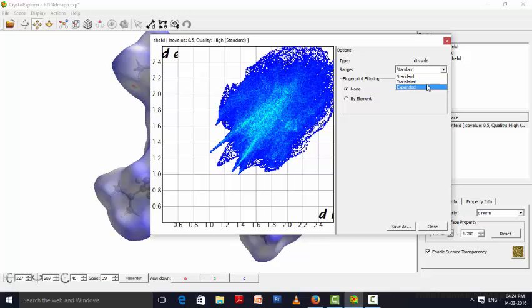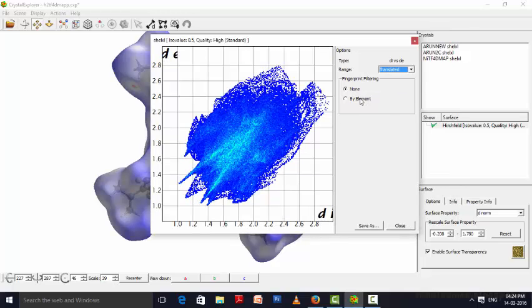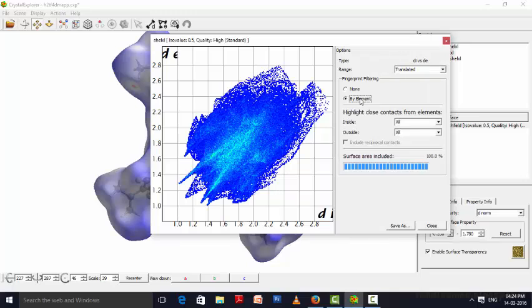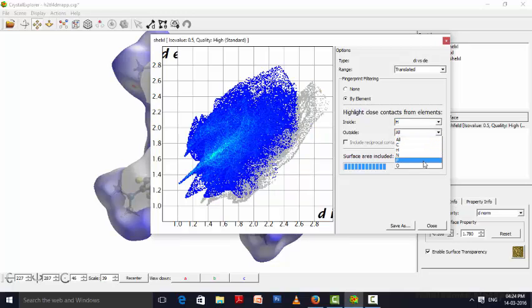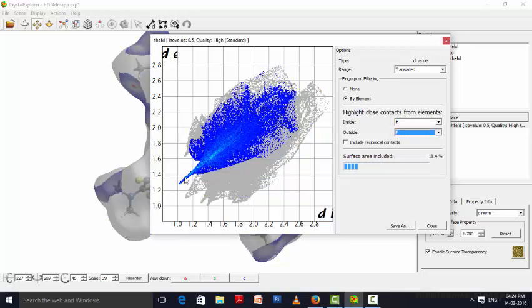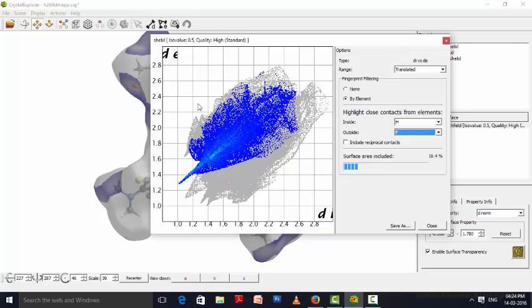I will be just making inter-translated view. And then by element, we will be selecting. We want to say a hydrogen inside and fluorine outside interaction is there. Then this spike will be coming specifically. Actually, before going to the interpretation, we must have to know what the dI value stands for. dI is distance from the Hirschfeld surface to the inside molecule, and dE is distance from Hirschfeld surface to the external molecule. Here you can see what we have fixed: the internal atom is hydrogen and the outside atom is fluorine. So we are getting an image like this where we are having a spike here.